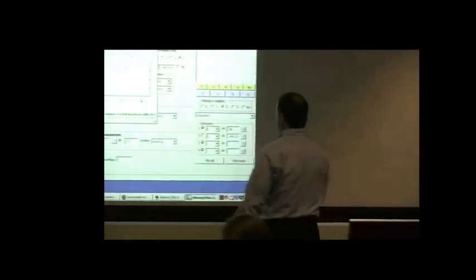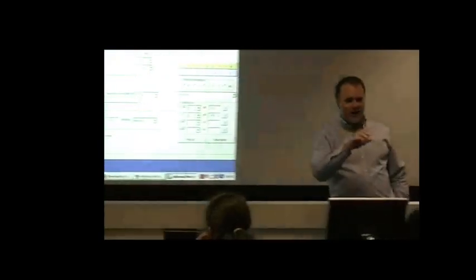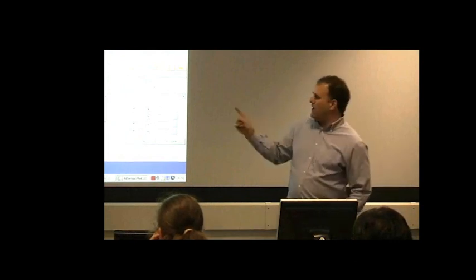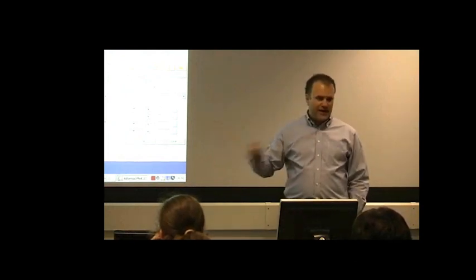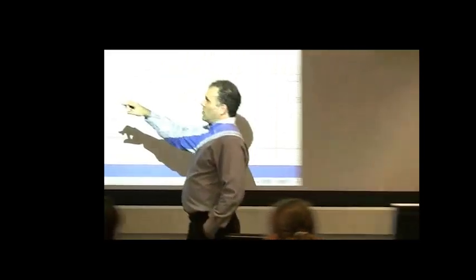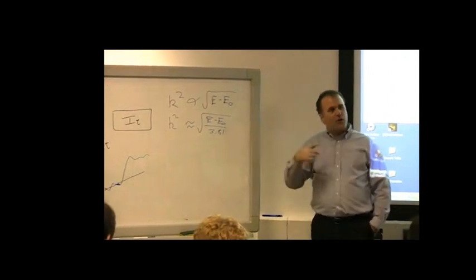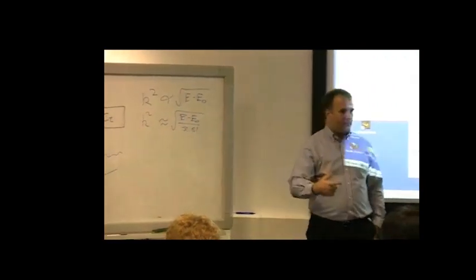Okay, so that's the beginning of the answer to your question. That's how the x-axis relates between energy and K. We do this coordinate transform on the x-axis when we go from energy to K. Okay, but that doesn't explain the transform that goes on the y-axis.